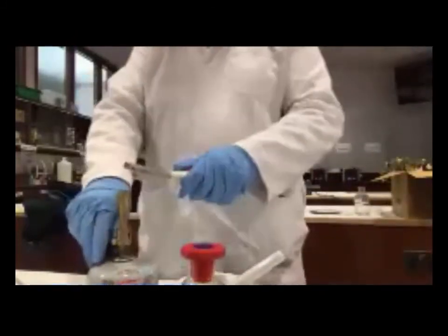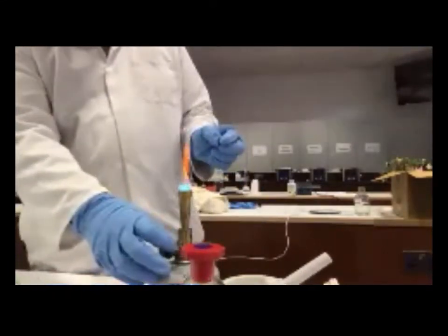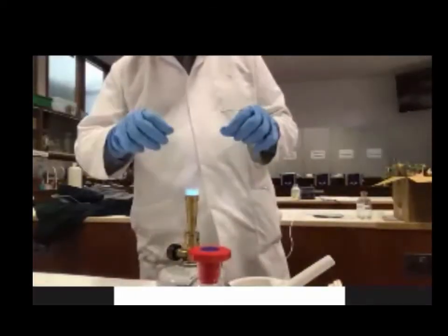Now I'll show you how to make up the dropper. Okay, now move the solvent away. Can you see this as well? I'll stop sharing. So we've got the Bunsen going here again. Turn the flame quite a good bit down.